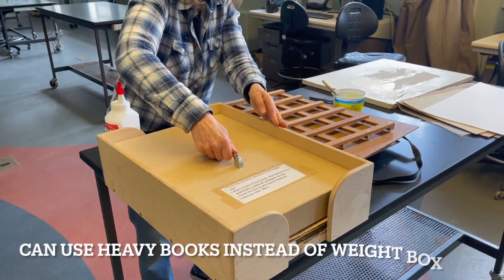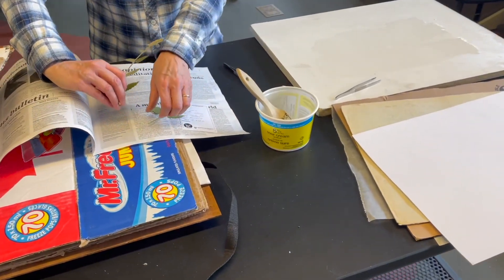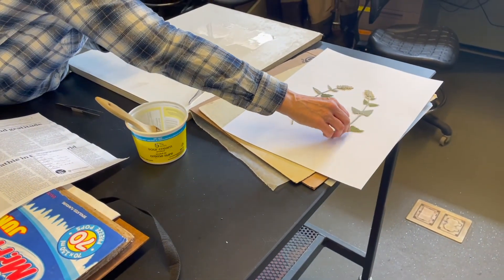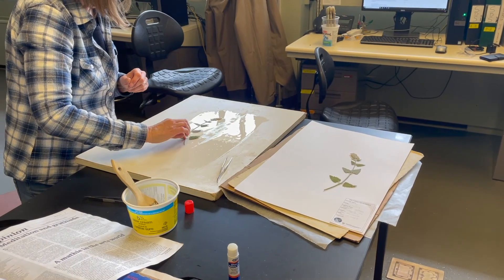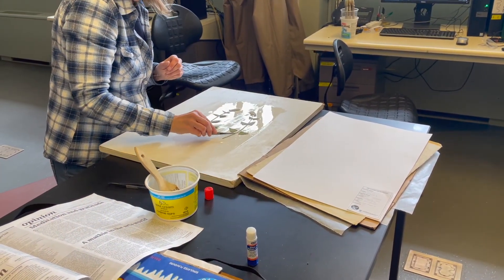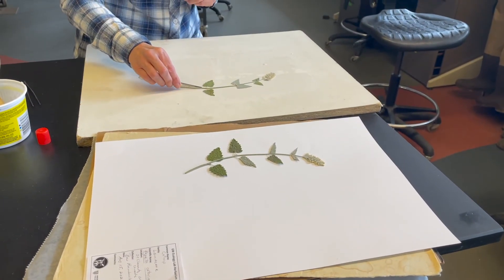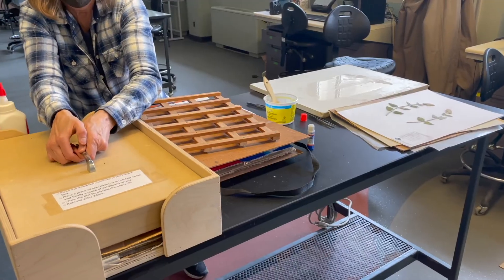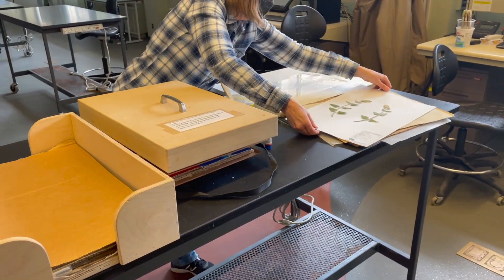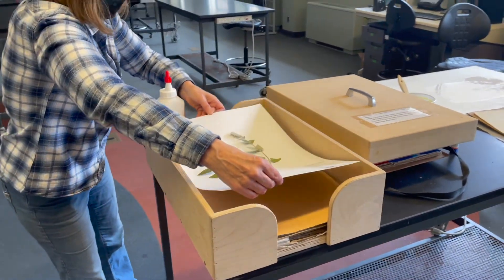If at home you can use heavy books in place of the weight block. We will now mount our next pressed plant, first laying it out to determine its position on the mounting paper and then moving it onto the glue board, making sure to press different parts of the plant down so they are in contact with the glue. Place the plant on the mounting paper. Remove the weight block, place the mounted plant in the box and again cover with wax paper, blotting paper and cardboard. Place the weight block on top.